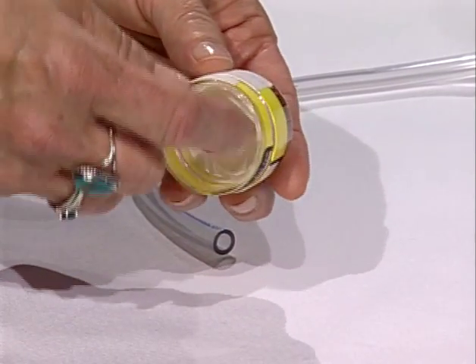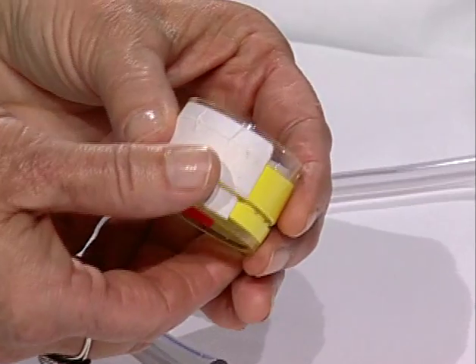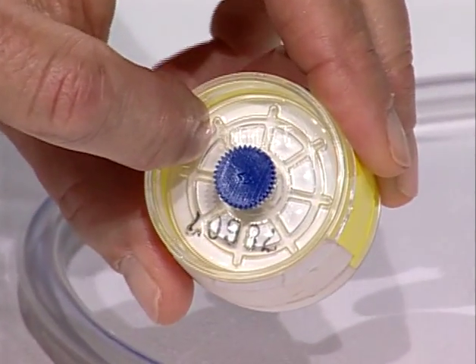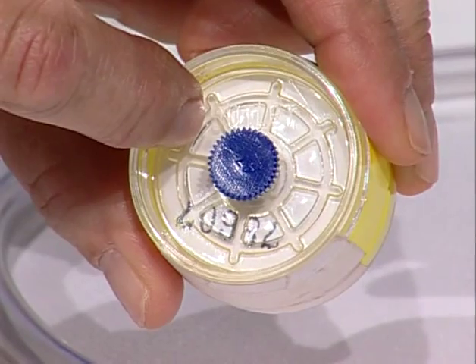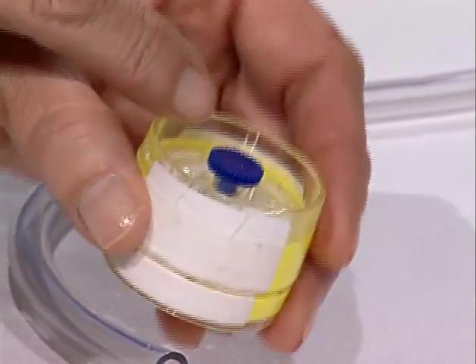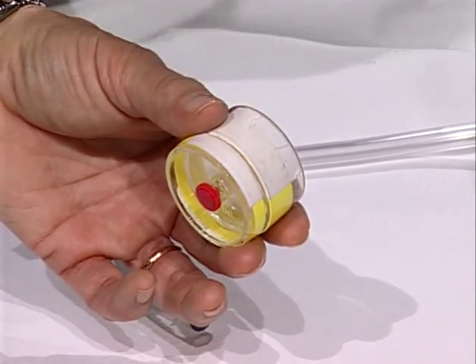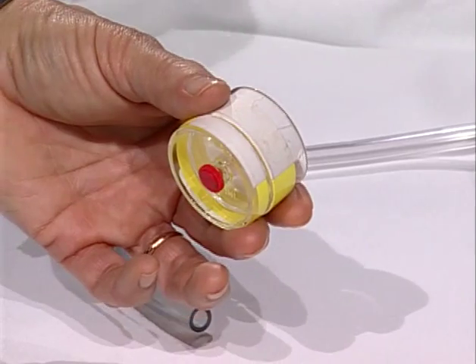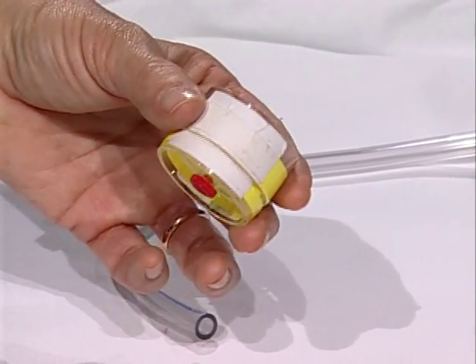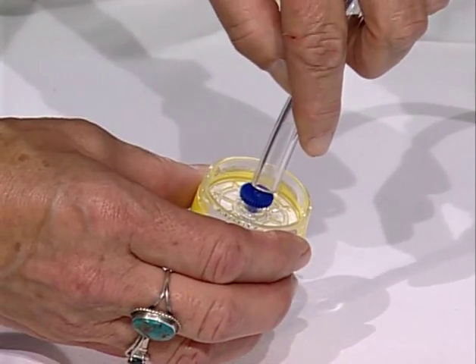Some manufacturers use an arrow to designate flow direction. These particular filter cassettes have a wagon wheel design on the outlet or backside. Remember, the direction of air is from the work area through the opening in the cyclone and then into the filter cassette. Air exits through the tube that is attached to the pump.